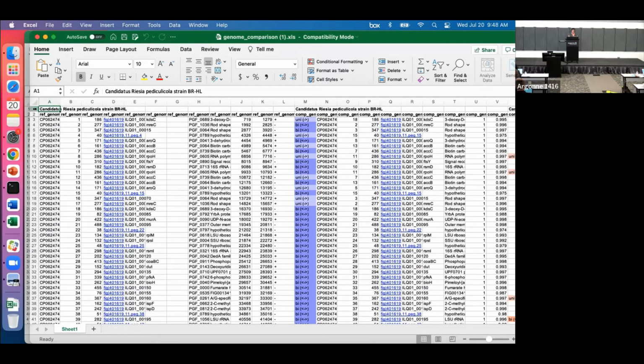The very top row is showing you the genomes and the analysis. And the first one is our reference genome. Let's go down to the second row. And the first one is telling you the contig that it's on. If this is in multiple contigs, this is important so that you know where things are. Okay. The second column is showing you the gene number. It's starting at the first and working its way up in the reference, and it's searching for its best match. This is like a gene dating service, right? So it's like eHarmony or something. It's trying to make the perfect match for these things.